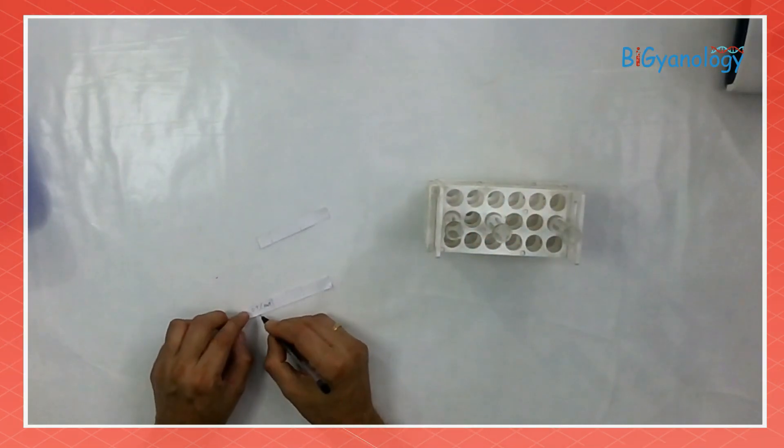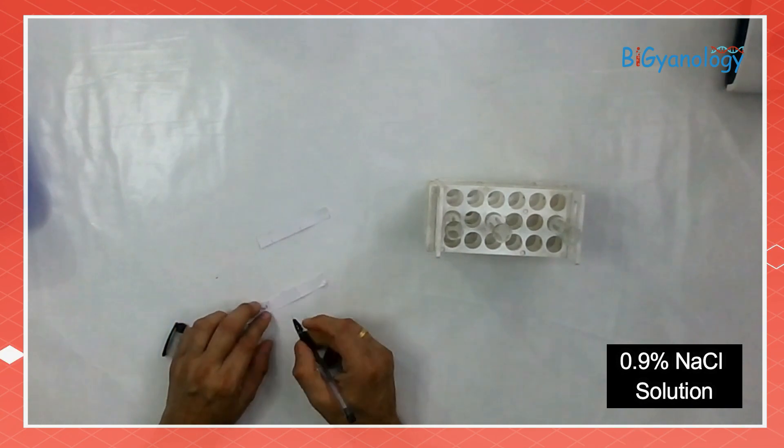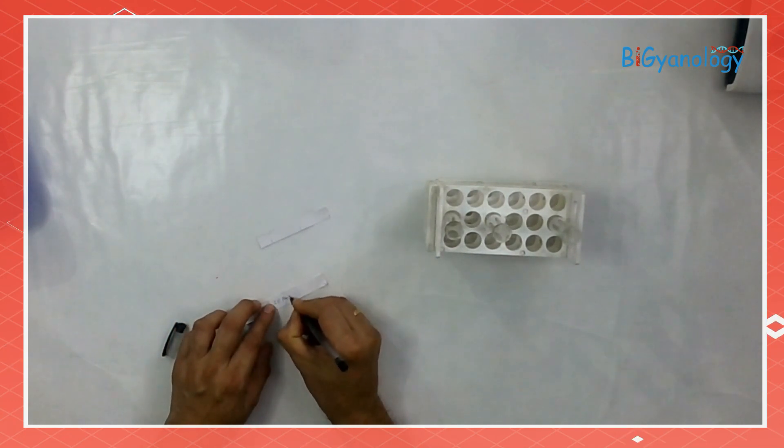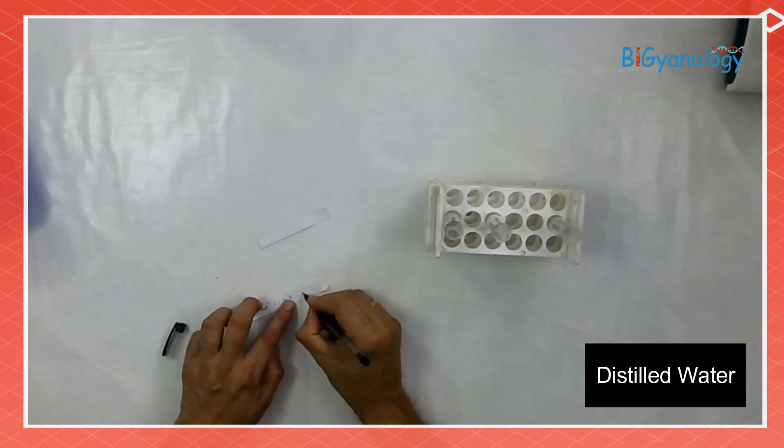For that we need a test tube rack and three test tubes which should be labeled. I am labeling the test tubes beforehand — one labeled as 0.9% NaCl, another 5% NaCl, and the third one as distilled water.